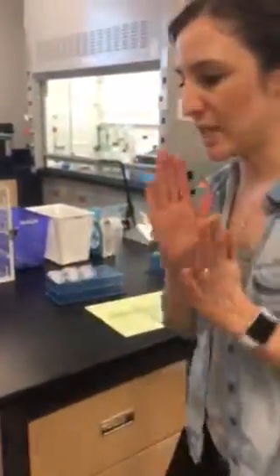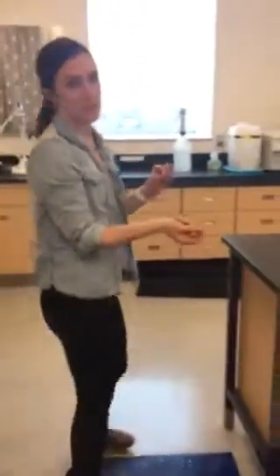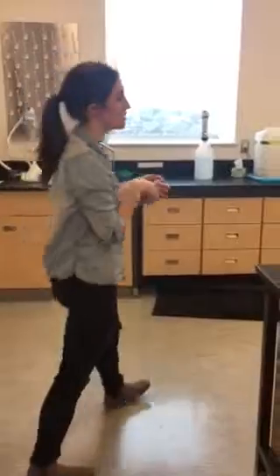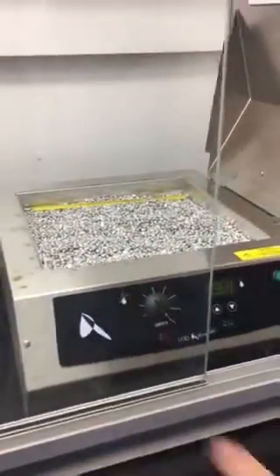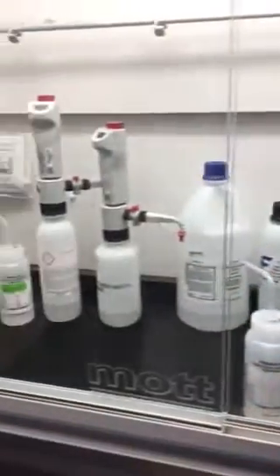So the first step is to weigh the sample and batch it with your standards. The second step is to bring it into the chemistry area. And so we use this really neat bead bath, which is heated to 80 degrees Celsius. All the tubes get loaded into the bead bath with the various chemicals that they require.